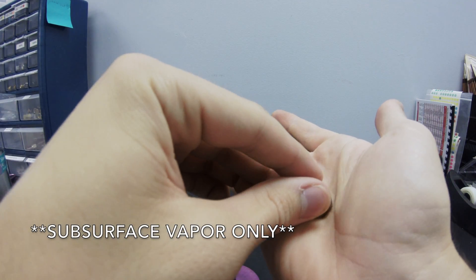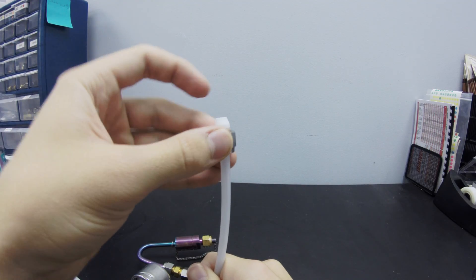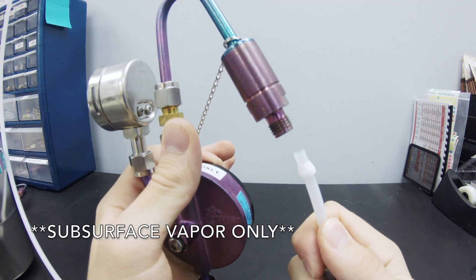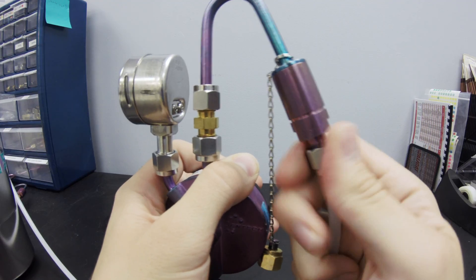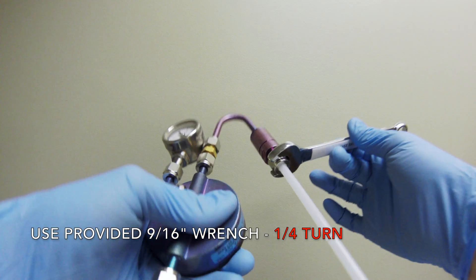For subsurface vapor sampling only, slip the ferrule into the nut with the wide end of the ferrule down. Carefully slide the ferrule and the nut onto the tube as shown. Slide the tubing into the inlet of the flow controller. Tighten the nut until it is finger tight, then use the provided wrench to turn the nut one quarter turn more.